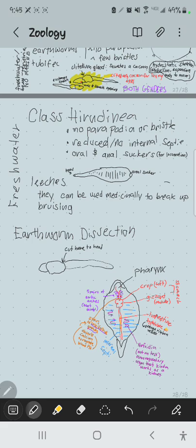You can take a look at the specimens. We have the slides here. We don't need these slides, these are okay. So don't worry about these. We'll just look at the earthworm cross section. There's also some slides here of a leech, a whole mount leech. I'll probably have those leeches on the exam, but that's what that is. It's basically a whole mount leech. You can kind of see those. Okay, I'm gonna go get some more ethanol to euthanize the worms. You guys can get your dissection cans and get ready to go, and I'll be right back. Questions? Look good? Okay, be right back.